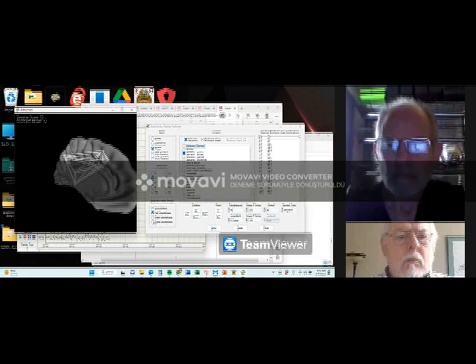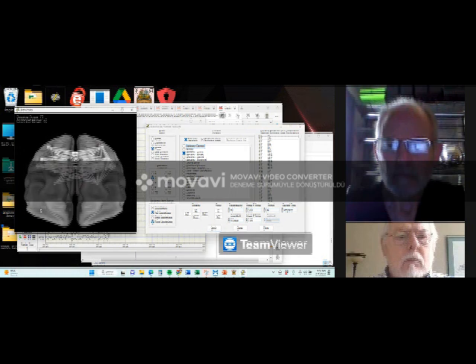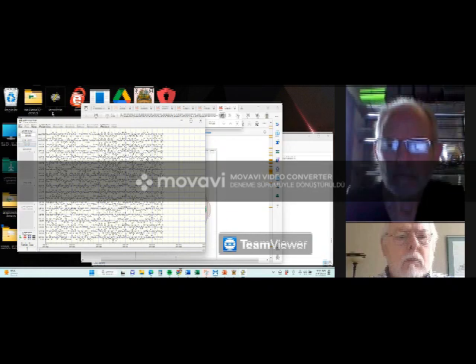You can look at just part of the brain, and you can look at all of them. So you can play around with that. So that's the first Brain Surfer we put together.